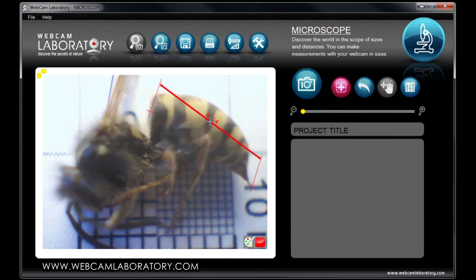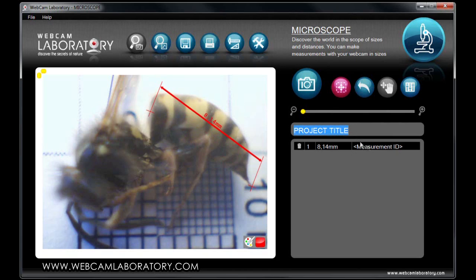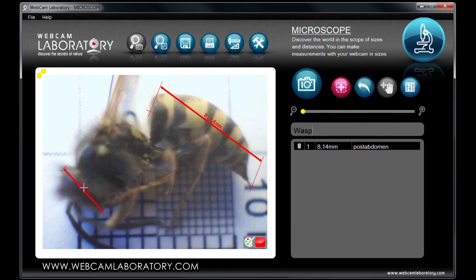Once the measurement is taken, it makes sense to identify the project name and the name of the measurement itself for easier identification in the future. You can now continue your experiment and measure the wasp's head, leg, or any part of it. After this, we should identify the measurements by selecting a name for them.